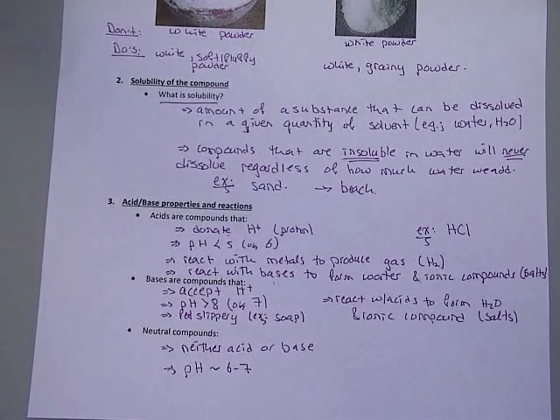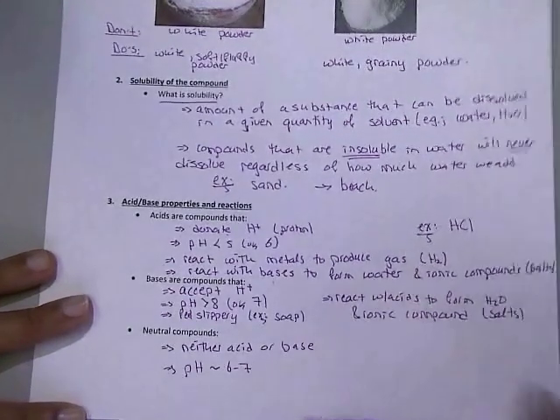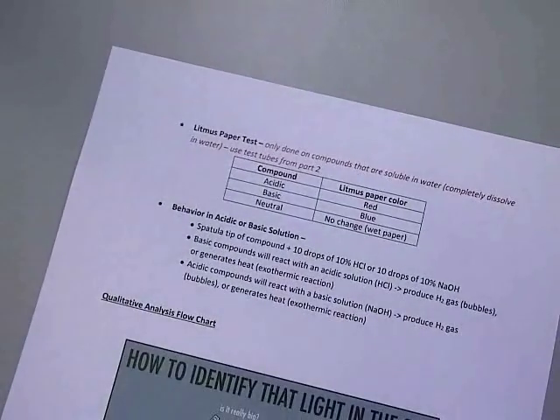So that's part 3. In part 3, you're really dealing with acids and bases. You're also performing litmus paper tests, and you're performing behavior of these compounds in acid and or basic solutions.